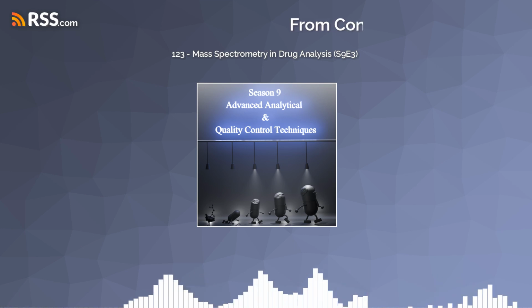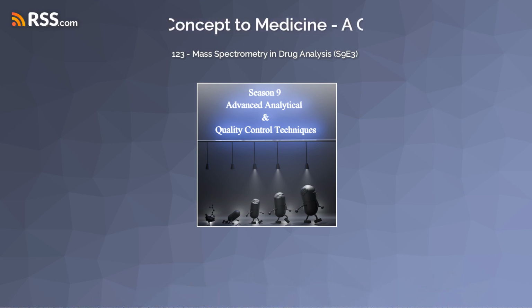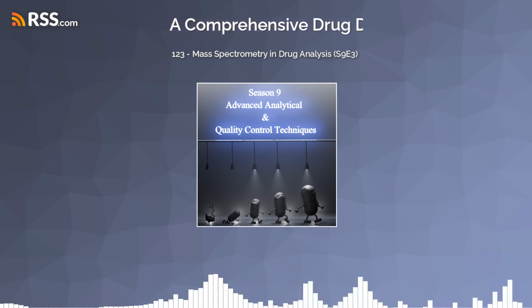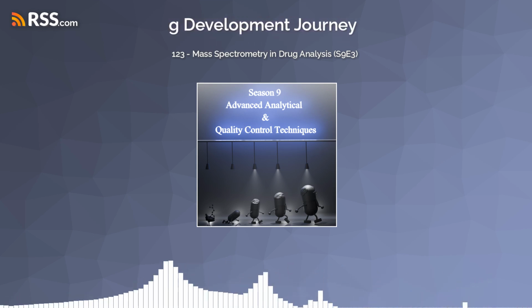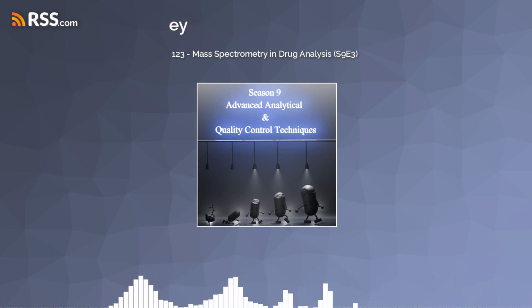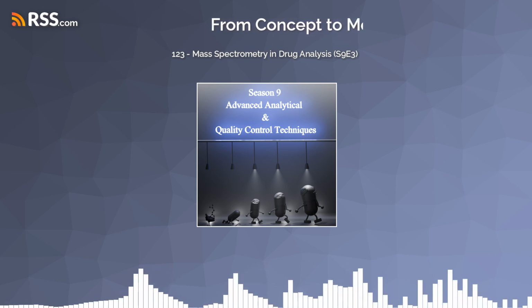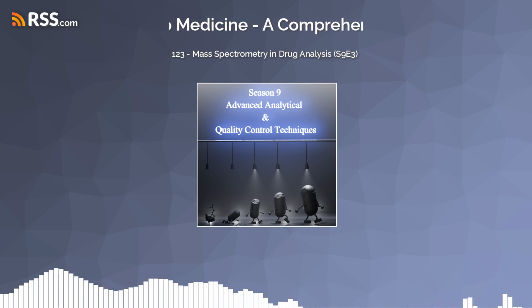Now, mass spectrometry isn't always a solo act in the lab. Often it teams up with other techniques, and one powerful partnership is with LC, liquid chromatography. LCMS, I've seen that a lot. What's the deal with that? You're right. And in the real world of drug analysis, we're often dealing with a mixture of many different molecules. This is where combining techniques becomes really important. So LCMS is like a dynamic duo that's really valuable in the pharmaceutical industry. Okay, so the hyphenated just means two different techniques working together.